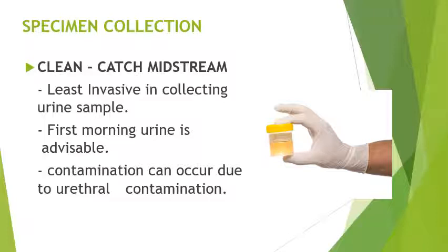Note, advise the patient to have a first morning urine. Kung hindi makakakuha ng first morning urine sample, dapat the urine must be in the bladder for at least 4 hours. Okay? So, note, there is a proper collection of the urine during the midstream catch, clean catch. There must not be contamination of the urethra, particularly sa babae, kasi usually, pag sa babae, there will be possible contamination when collecting urine sample.